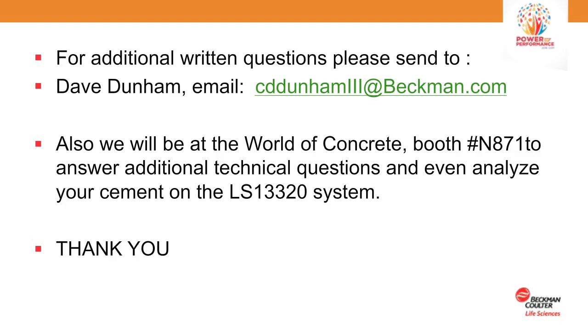Cement rinses pretty easily in cement components. So typically you would need no more than about three rinses of your module, in other words, a fill and drain. And the computer controls the speed of filling and draining, and this operation takes about a minute and a half between samples to actually rinse the module and then fill it with clean fluid, so you're ready to add another sample and run another sample.